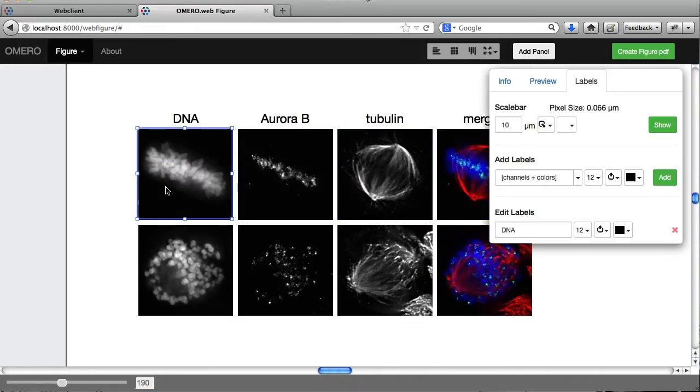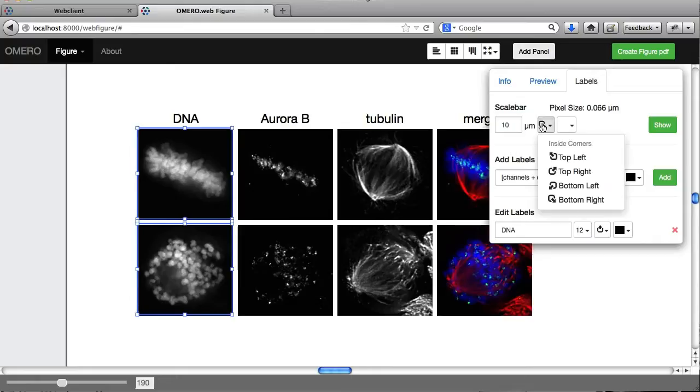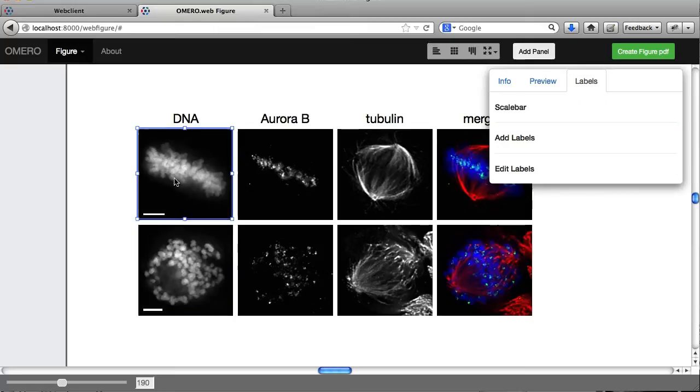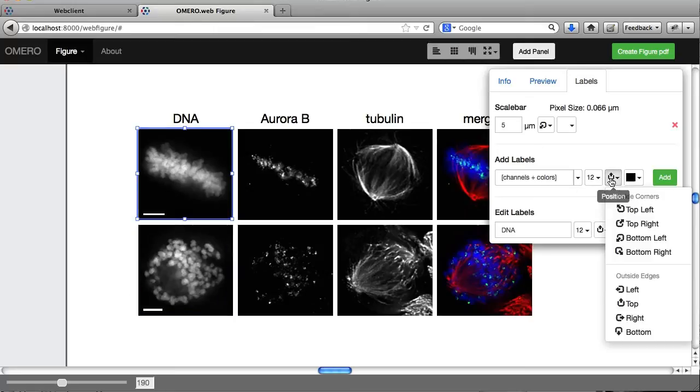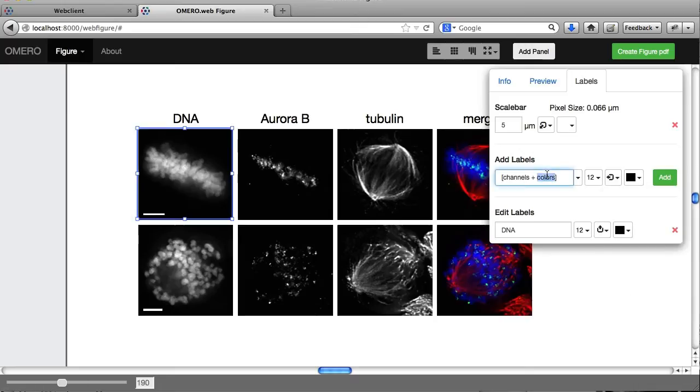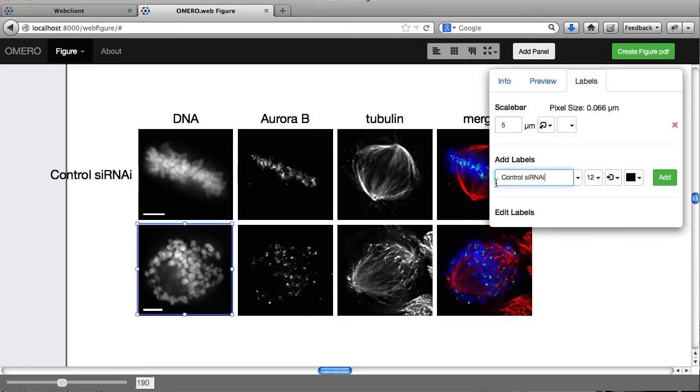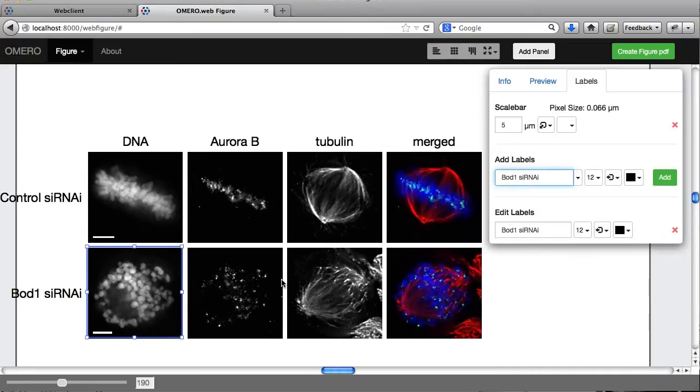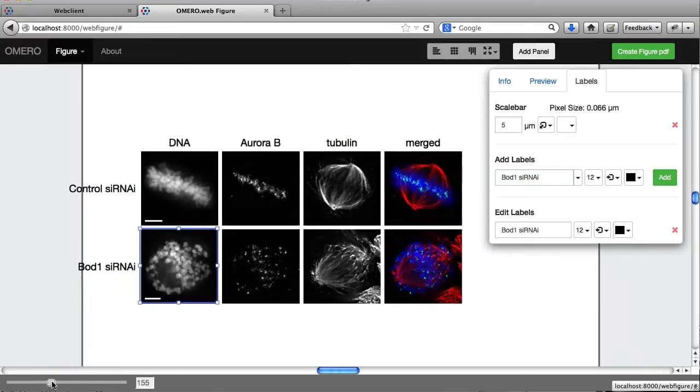And at the end here, I'm going to select these two and add a scale bar at the bottom left corner. That's 10 microns. And because we know the pixel size, I know how big the scale bar is going to be, let's make it 5 microns for both of those. And I'm going to add another label to this one. Adding it to the left. And that's going to be Control siRNAi. And I'm going to select the next one down. It's going to be Bod1 siRNAi. And that's pretty much just done for this first part of the figure.